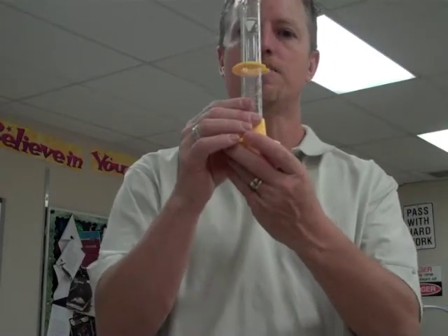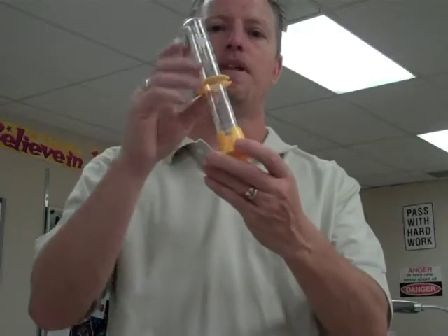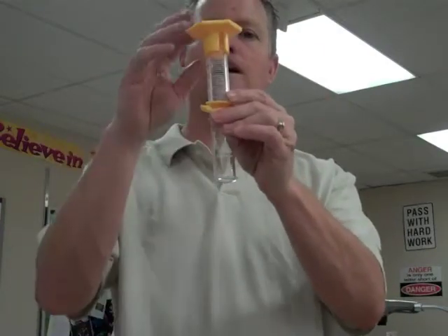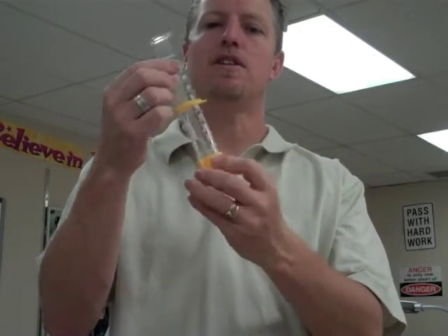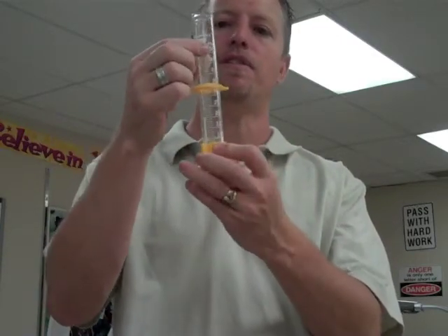This right here is a graduated cylinder. We remember that because it looks like a graduation hat. This is used to measure volume of liquids, and this particular graduated cylinder measures accurately up to 50 milliliters. They come in many different sizes.